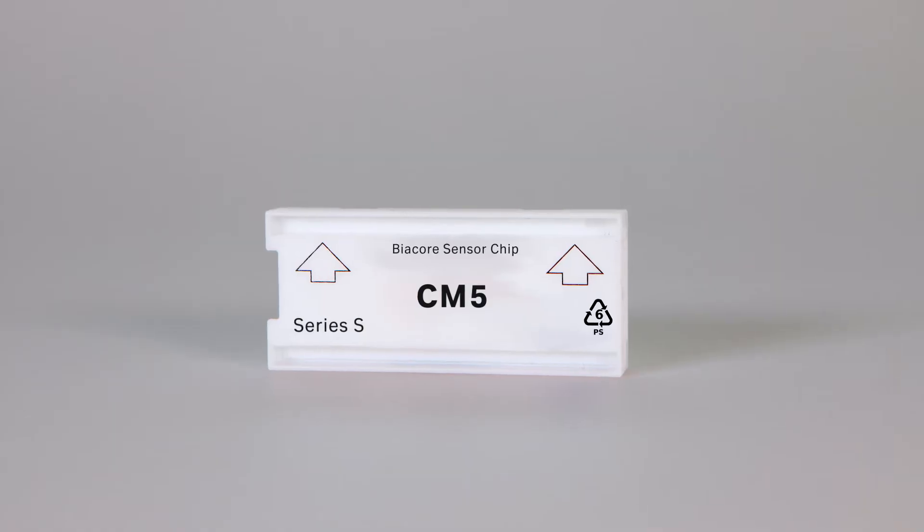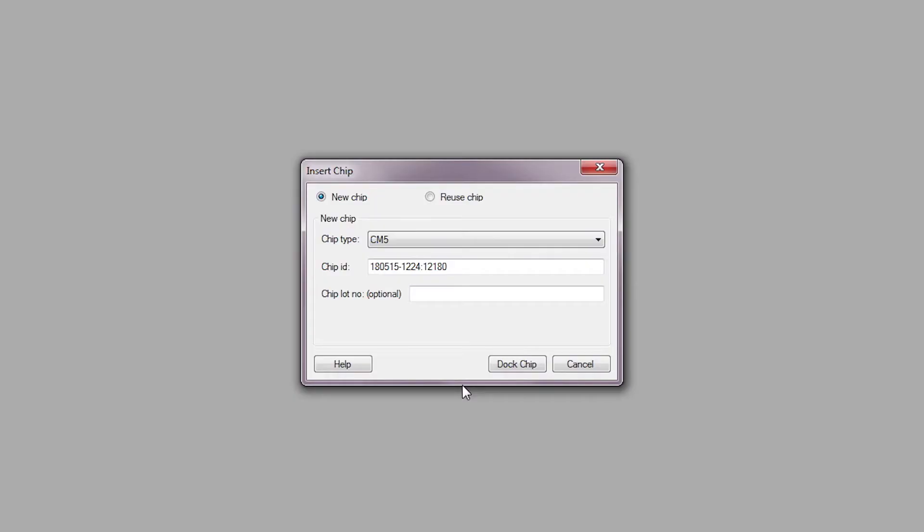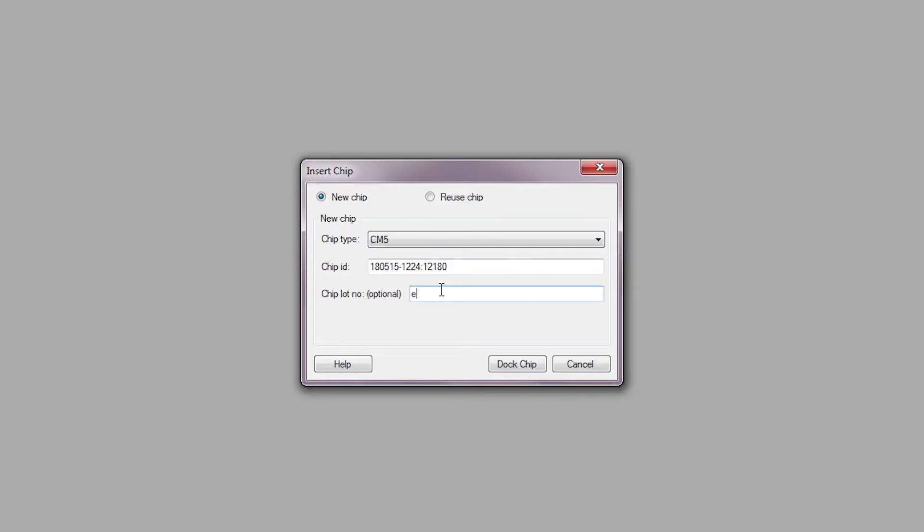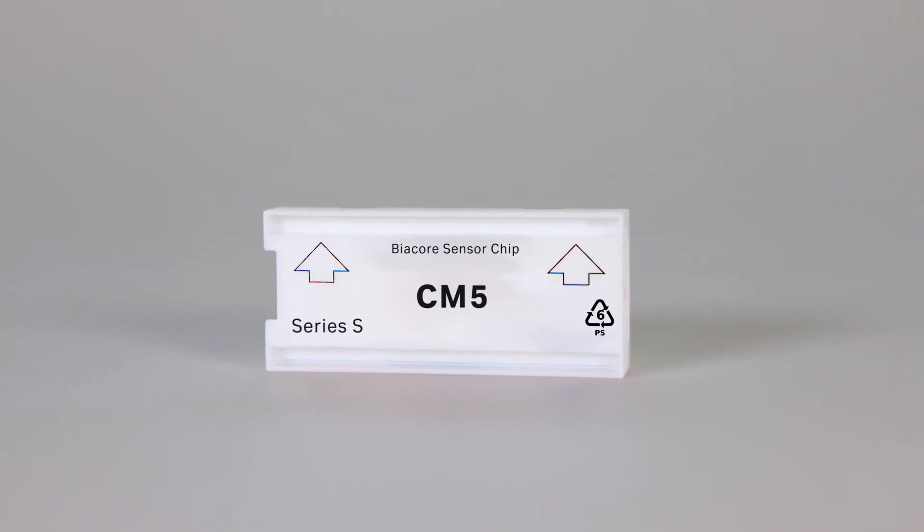Now we are ready to insert a sensor chip. Define the chip type, chip ID and lot number. The arrows on the chip case face the instrument.